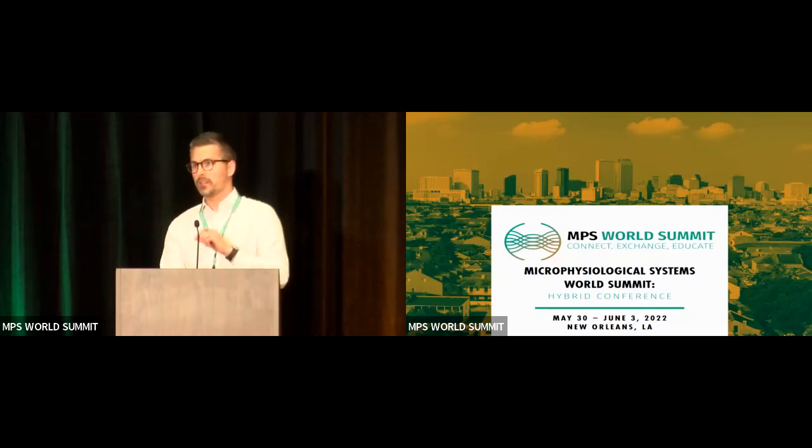And what's important is that this is done with cells that we know will work in these three-dimensional tissues. There's lots of primary cells out there that won't form good quality three-dimensional tissues in any MPS or even any spheroids. So I think I should qualify that these cells were pre-qualified to do that. And once you do that, you then get that high level of reproducibility.